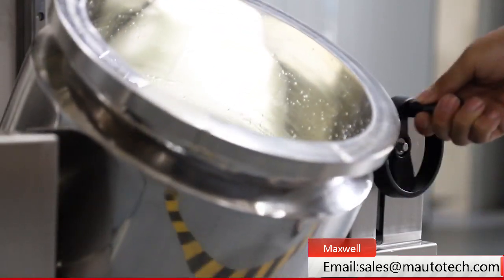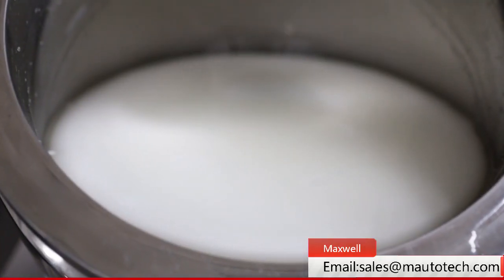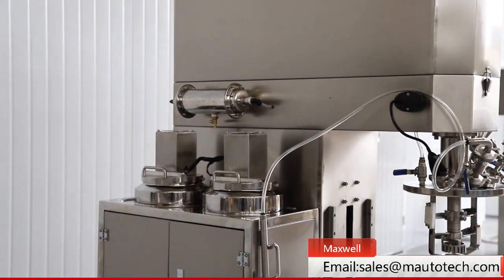With these three parts, this machine can make high quality cosmetics. Welcome to contact us at any time for further information.